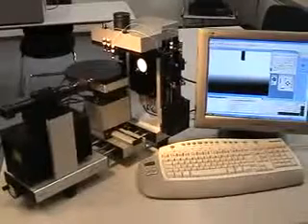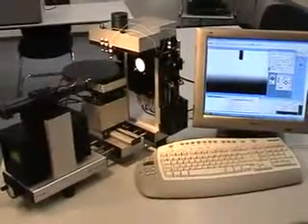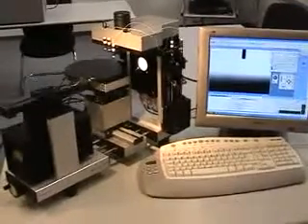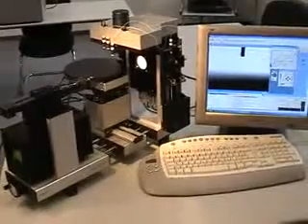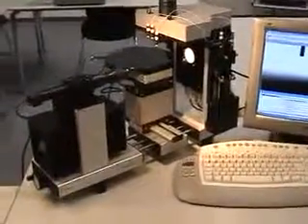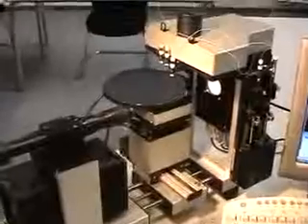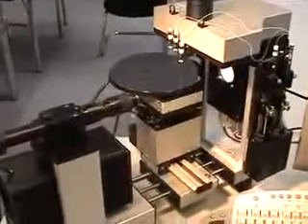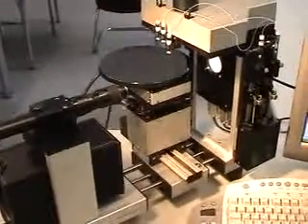This video will show the operation of an OCF 30 with a wafer table for 200 millimeter wafers. We would like to explain first the principal design of this optical contact angle meter.